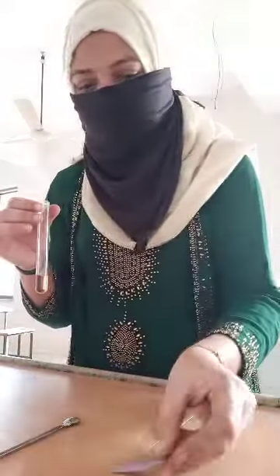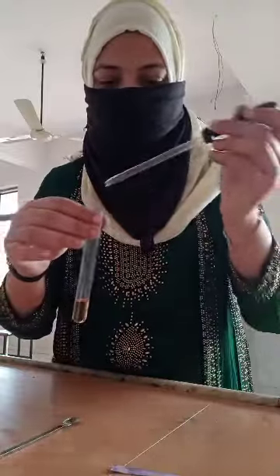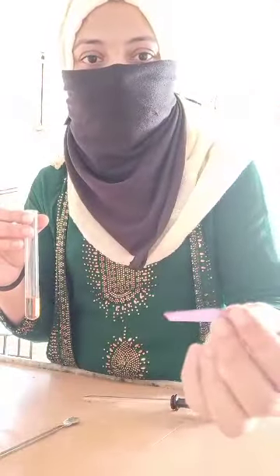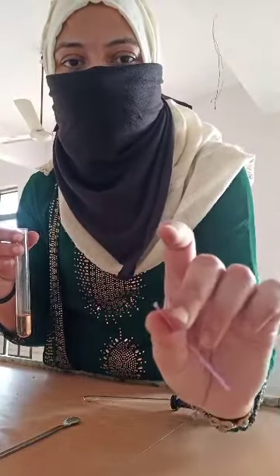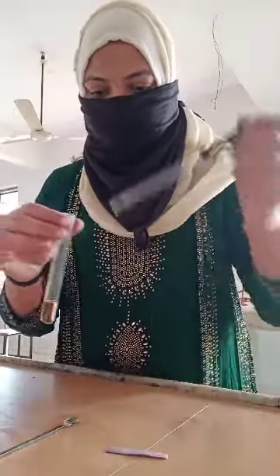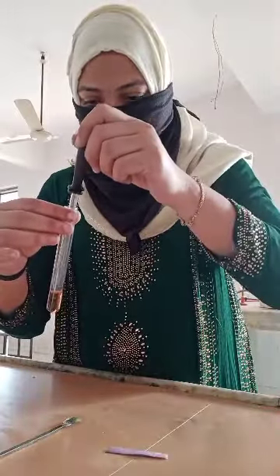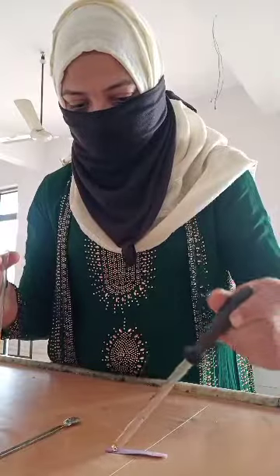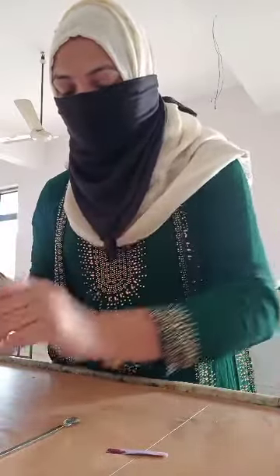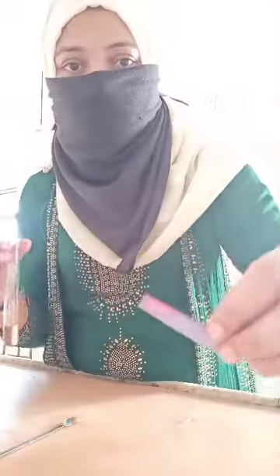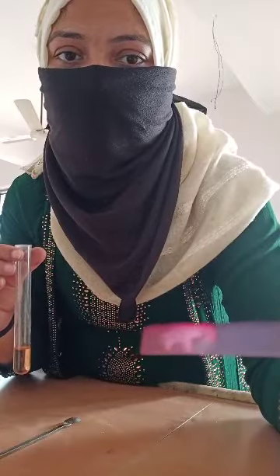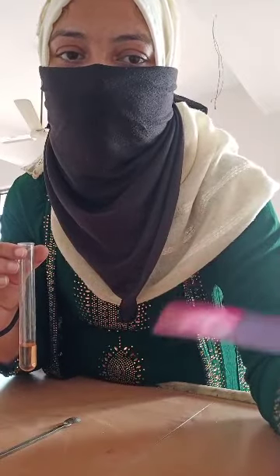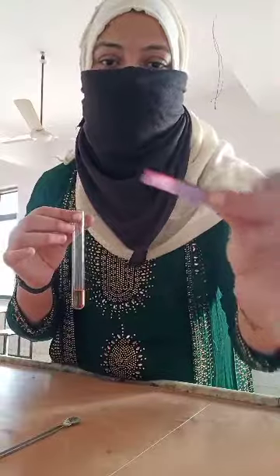What I have to do? I have to take this compound and place it on the blue litmus paper. This is your blue color litmus paper. As my hand is with the phenol, it turns red. Red coloration — so dear students, red color indicates the presence of phenol. Here is your phenol indicator.